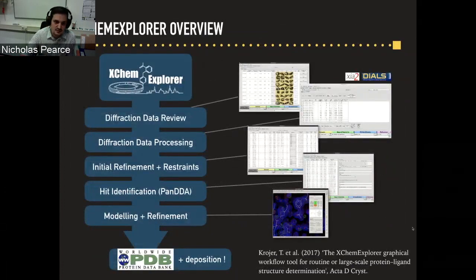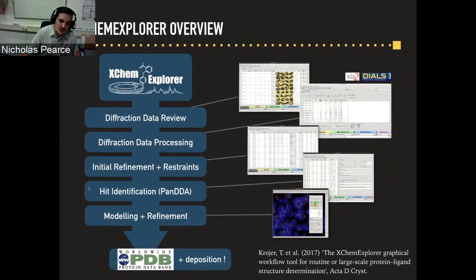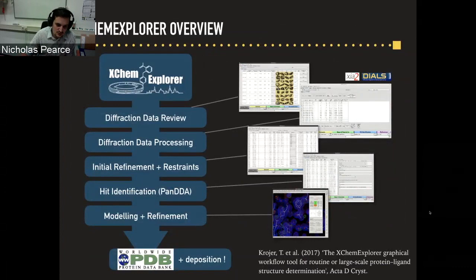XChem Explorer provides a GUI wrapping all of these tools, enabling quick review of diffraction data, processing all diffraction data, initial refinements with Dimple, hit identification, and PANDA Inspect for modeling and refinement — under the hood using the scripts I've gone through today. It also packages results to allow deposition in the PDB.